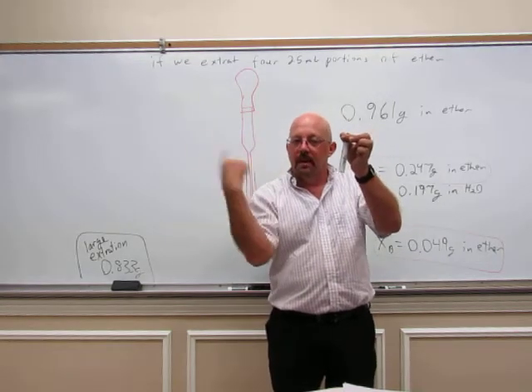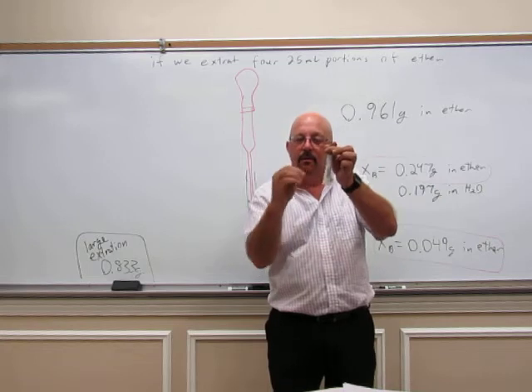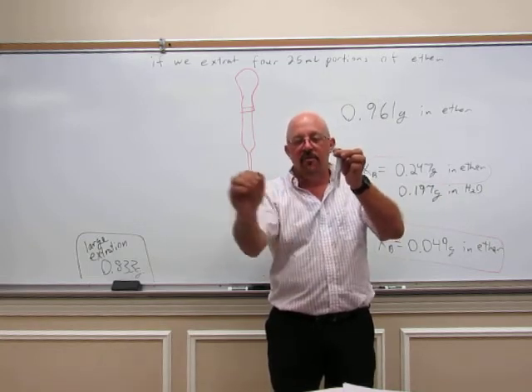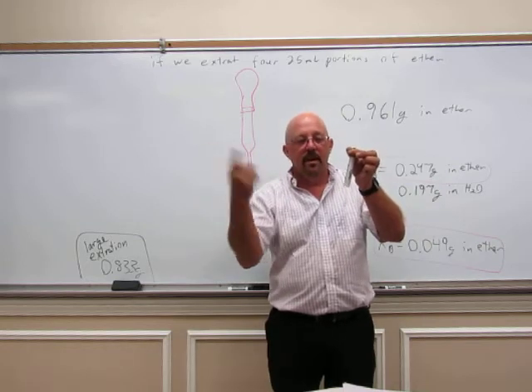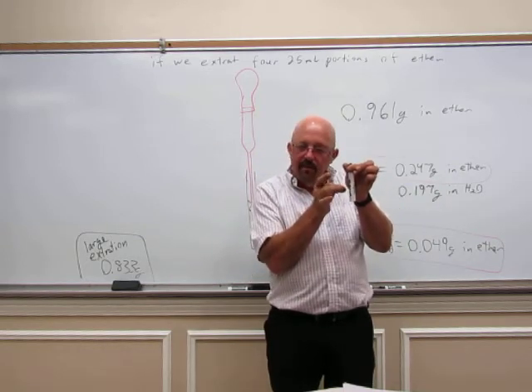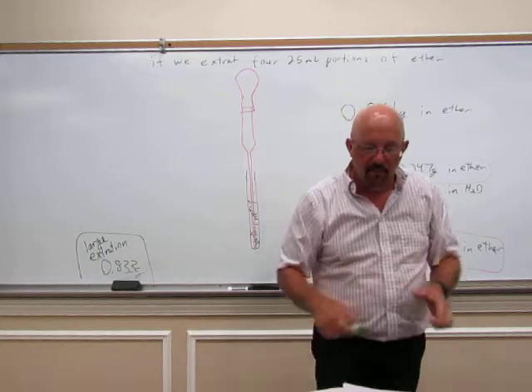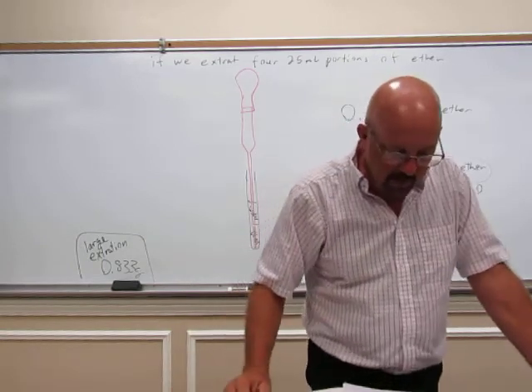Everything should start spinning inside if you're good at it. So just flick off to the side, just glance your fingernails off to the side, and that will get everything spinning inside. You sit there and do this, nothing happens. So just glance off to the side with your fingernails is the best way to do it. That's flicking the tube.